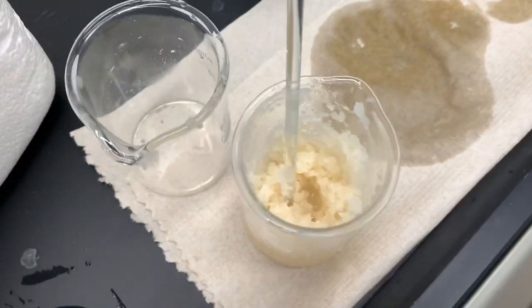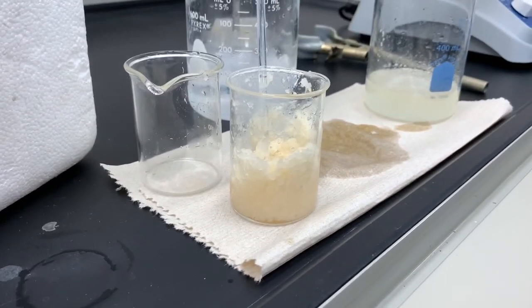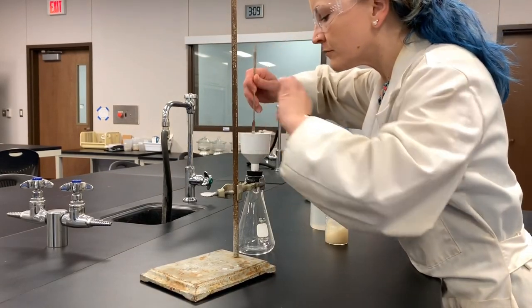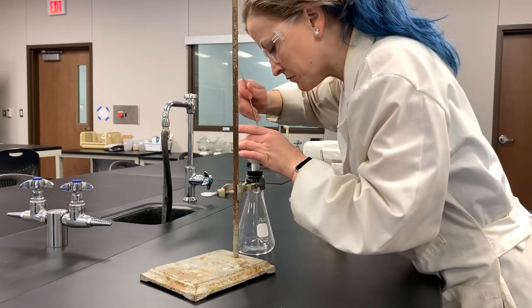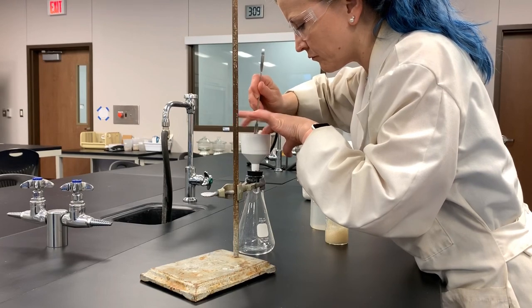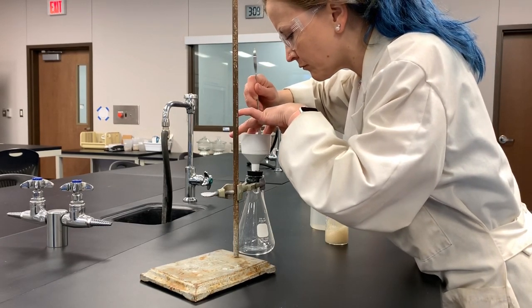Here's what our crude soap product looks like. We will then use a Buchner funnel to filter it and rinse it with cold water if possible. The procedure for doing a vacuum filtration is really important — you need to pay attention to these steps.